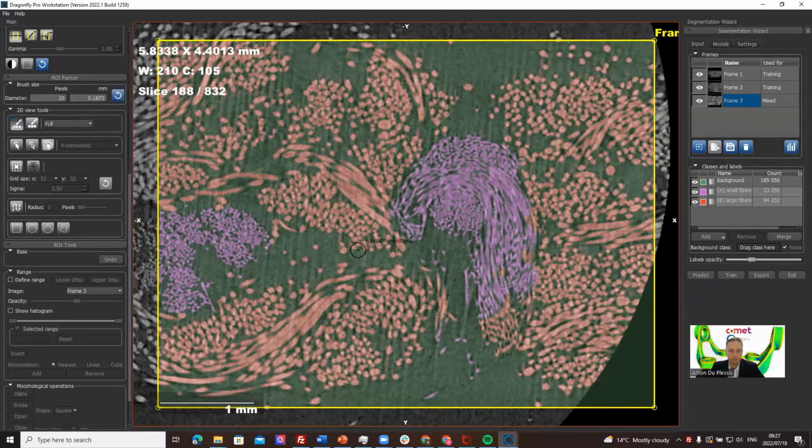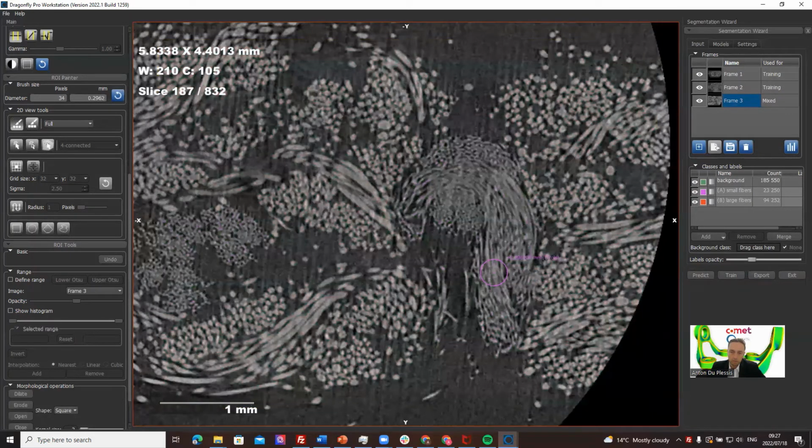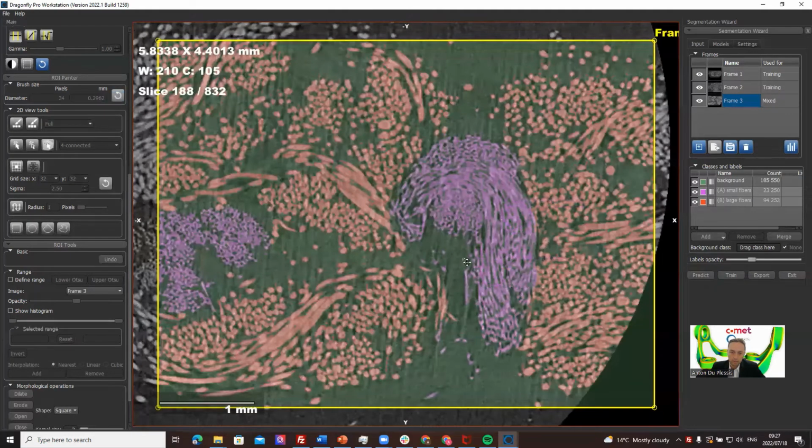So let's go again with a brush, again the purple and red. We need to click here again. There we go. Oops, I was scrolling by accident. Let's not do that.